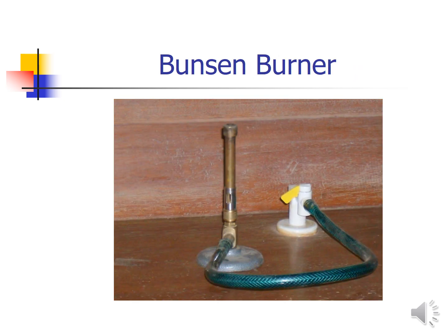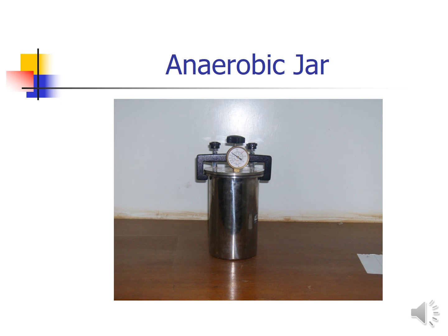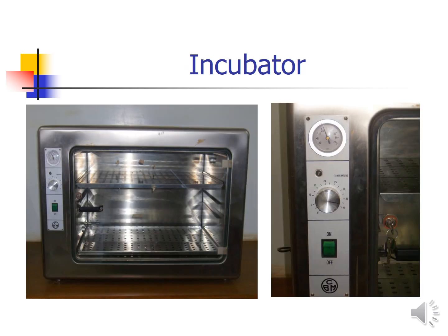This is a Bunsen burner. This is an anaerobic jar. This is used for anaerobic culture purposes. Fine. This is an incubator. So I think everyone knows what is the use of an incubator, right? Fine, need not explain.